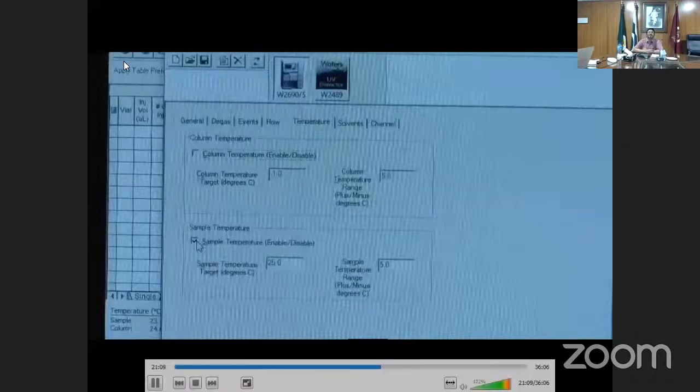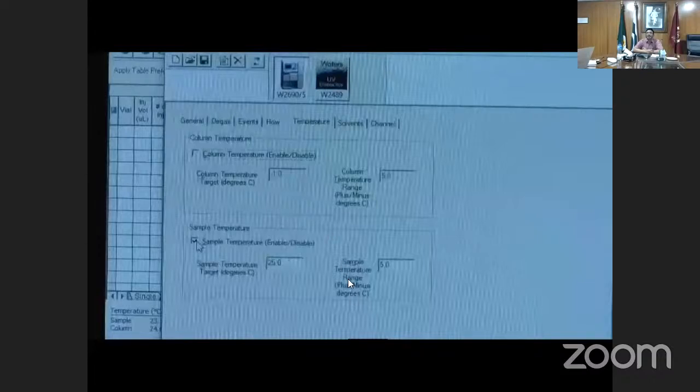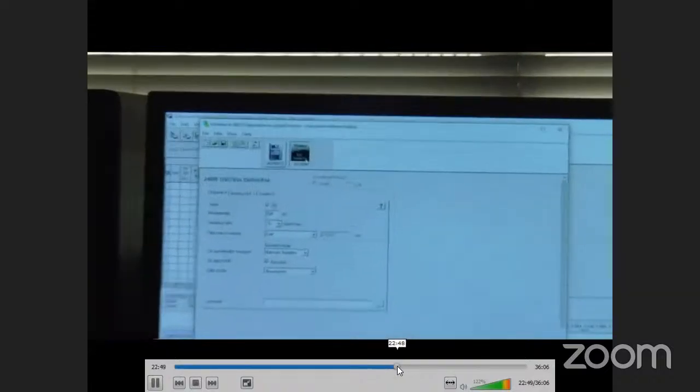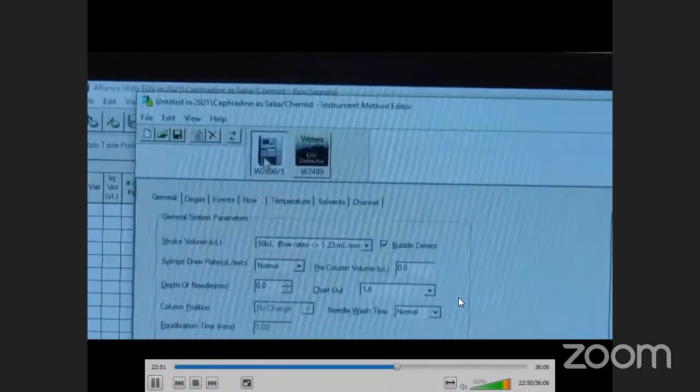Move next. We need to run standards, so we will click at start of the sample set. We will run standards. We will start with vial number 1. So here you will give the first vial, then click next. Each standard vial and other is for instrument.